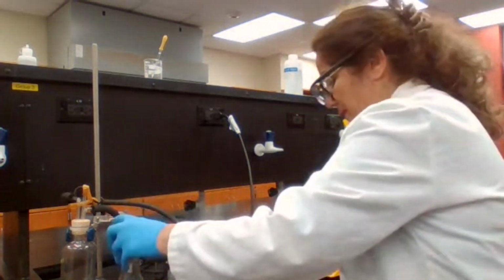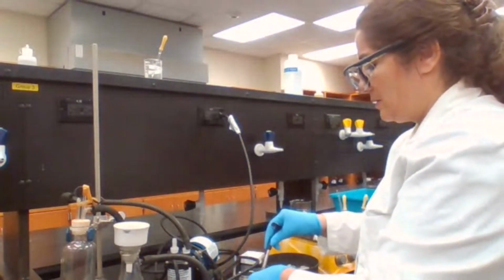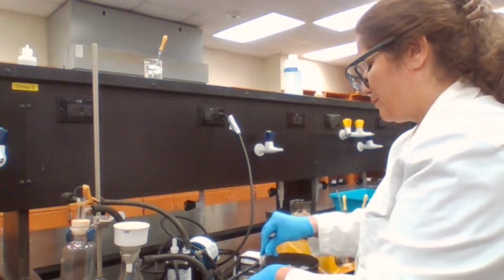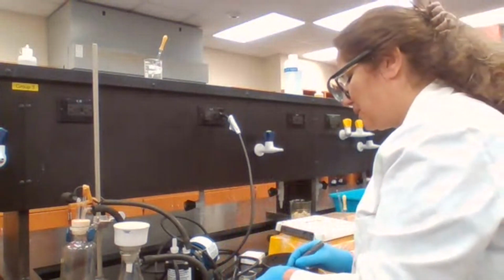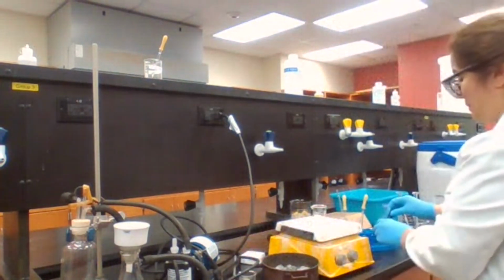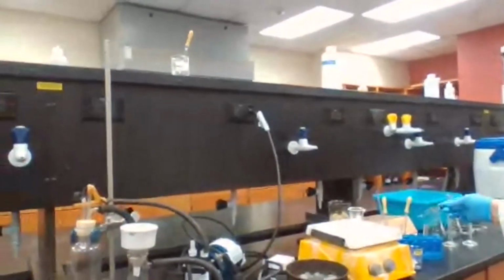Okay, transferred completely. I am using some methanol to wash the product from filter paper, to make sure everything is transferred. And start heating the sample to dissolve at high temperature.